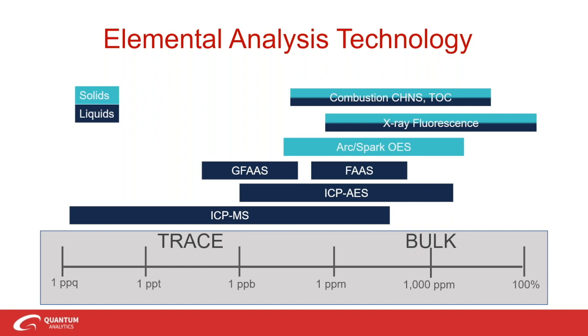Now, as opposed to ICP and AAS, XRF spectrometry does not require sample dilution or digestion, therefore allowing very easy and essentially non-destructive analysis. By avoiding the potential for inaccuracies caused by incomplete digestion and large dilutions, the complete analysis by XRF helps to ensure the accuracy and reliability of these results.